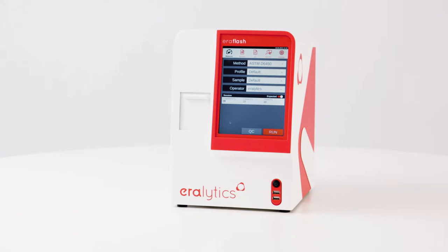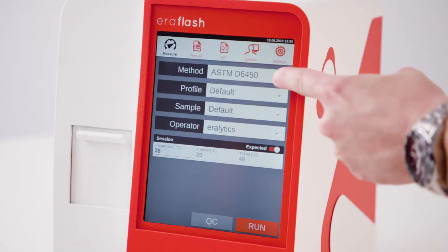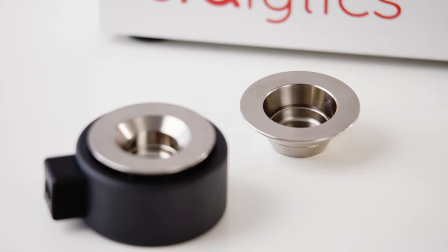Measurement. The intuitive user interface guides you through the measurement. Select a method from the drop-down list. Use the 1ml sample cup for D6450 measurements, or the 2ml cup for D7094 measurements, as well as all other methods.